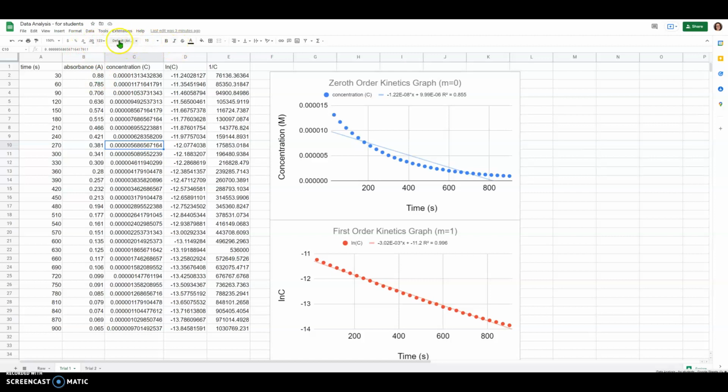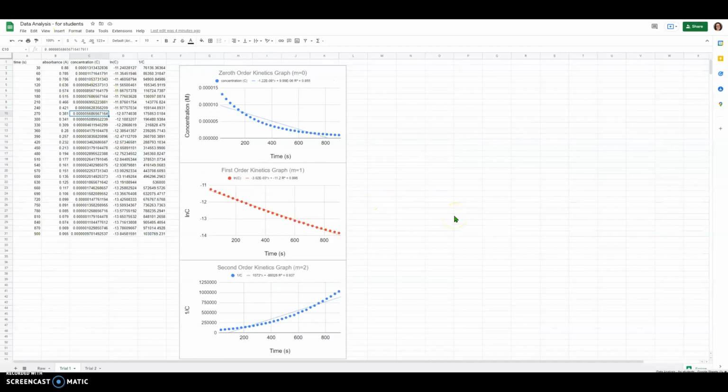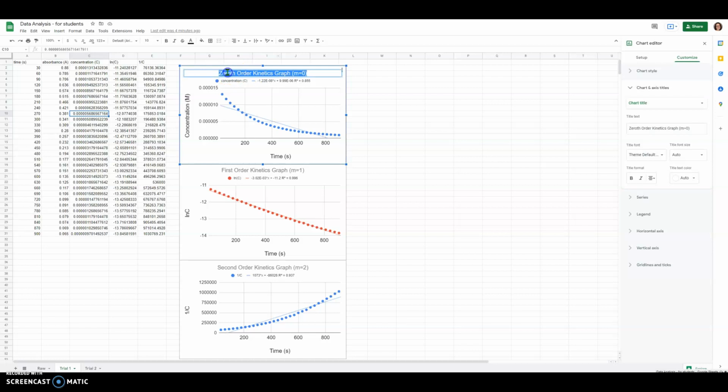All right. That pretty much wraps this up. Remember that for the formal writing, you want to be including all 6 of these graphs. One final change I would make to your titles is to make sure they are labeled with which trial they are. So this is trial 1 for these 3 graphs that I had on the trial 1 page.